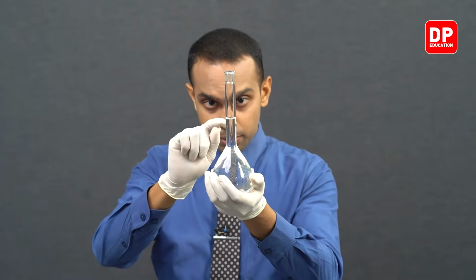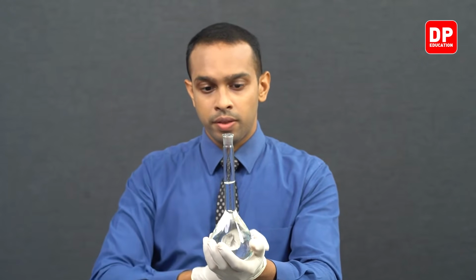At this point, students, the meniscus aligns perfectly with the calibration mark.